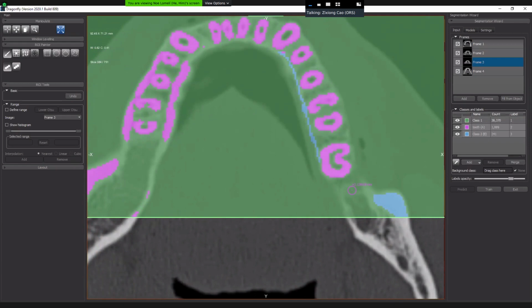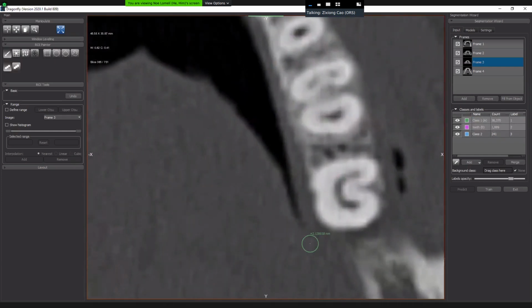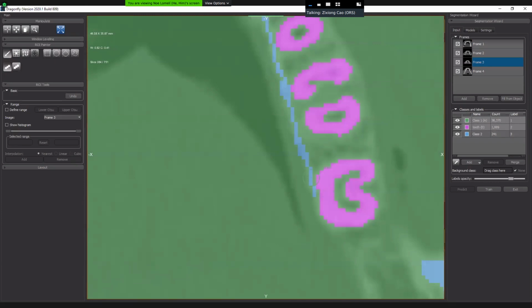Yep. So now when I do this myself, I don't care about the order of which two classes I selected, which is A and which is B, because I can always switch by the keys. If I use the control key or the shift key, I see the brush color change, so I know which one I'm painting.